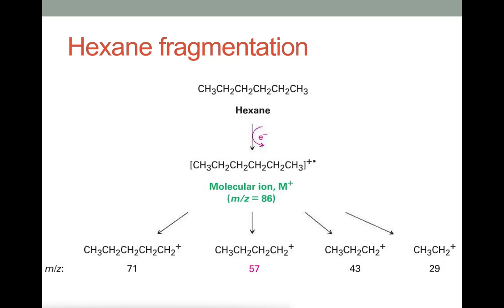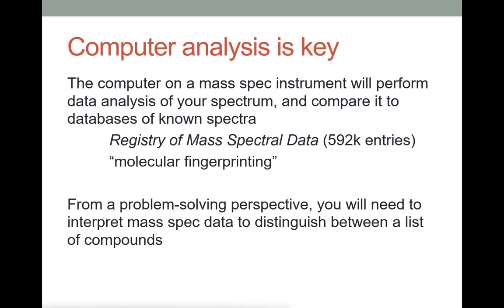Thankfully for you and I, we're not 50 years ago, we're not 30 years ago, we're not even 10 years ago. We have computer analysis. So that mass spec that you're loading your sample into is tied to a computer that maybe is tied to the internet, or maybe it's a local database, but the databases that are out there put together by chemical synthesis companies, analysis companies, forensics, all sorts of different databases have hundreds of thousands of entries, and this number is probably outdated. And we can do something called molecular fingerprinting.